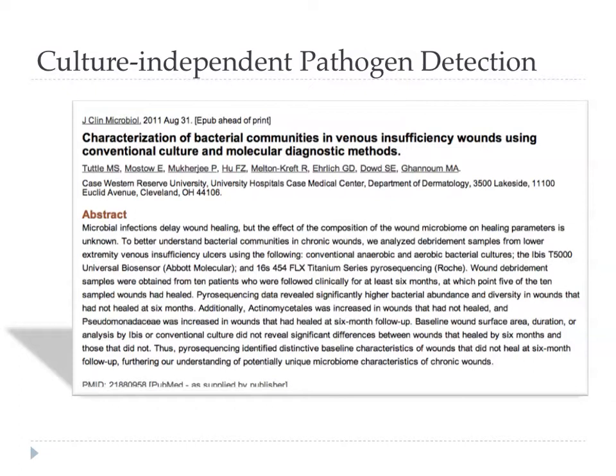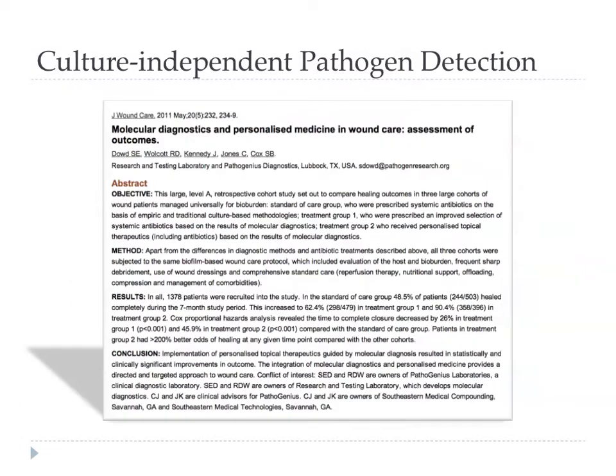And so what they did was they compared 3 different systems, and I think Captain Kirkup actually mentioned this study this morning. Basically, they showed that if you look, you can see a lot more using the high-throughput sequencing approaches. You get many more species and genera, bacterial genera out there, and you can identify wounds that were not going to heal very well from the community profile that you're getting out of the sequencing that you're doing.